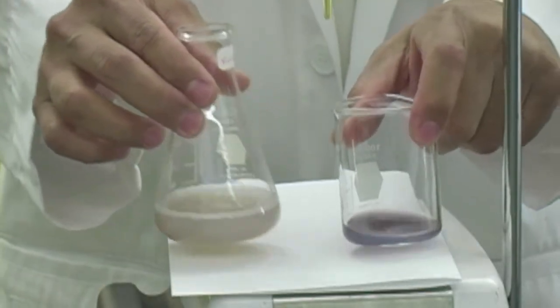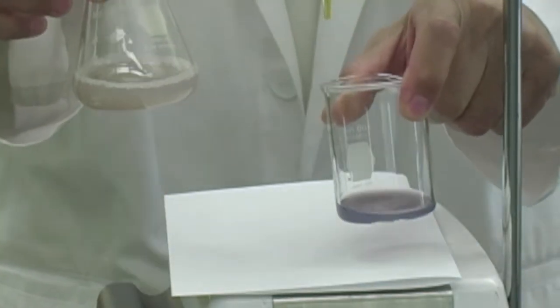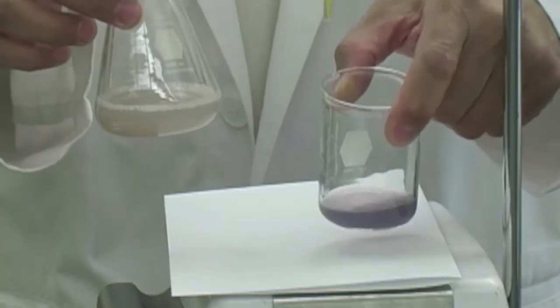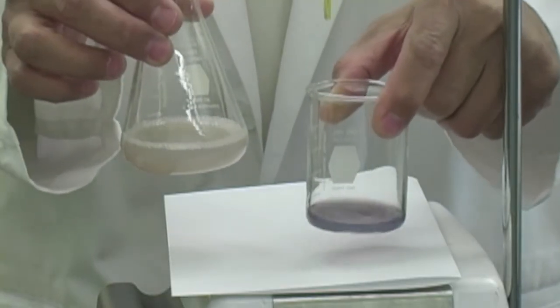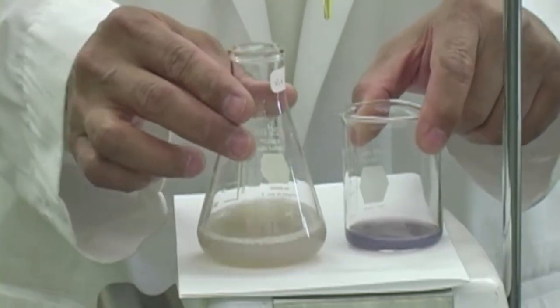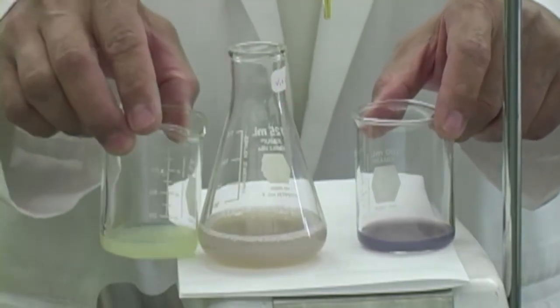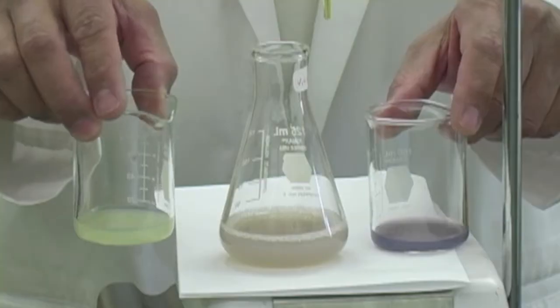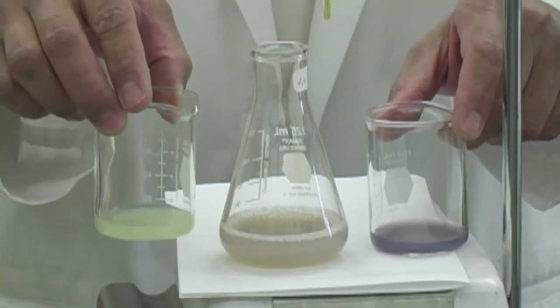This is the pre-titration to see what the endpoint looks like. You can see it's certainly darker than this right here. This would be the color of the lemon juice originally.